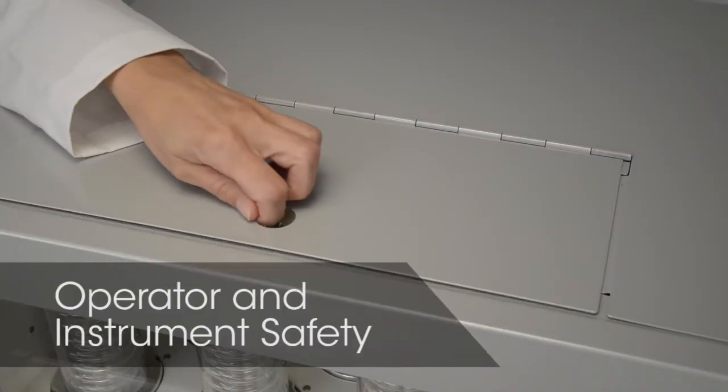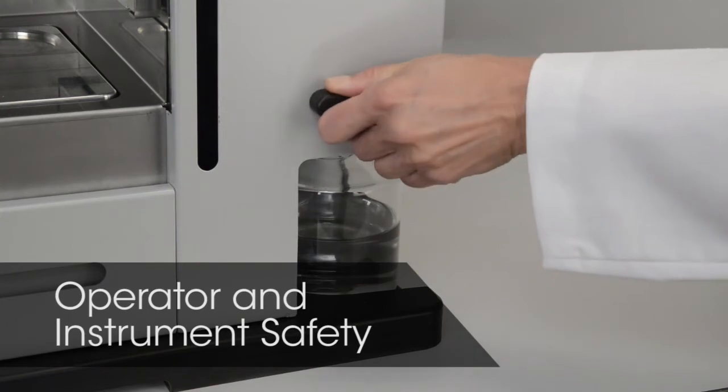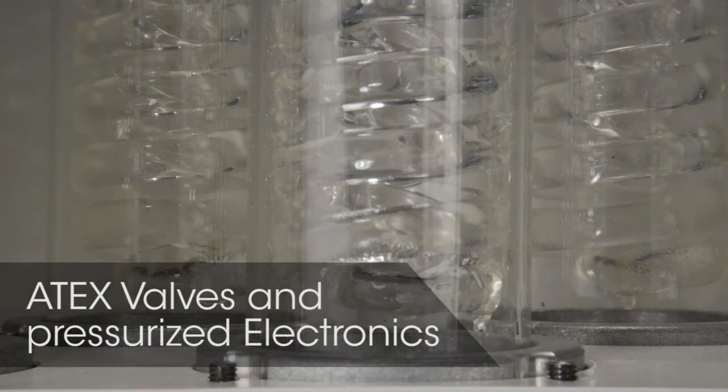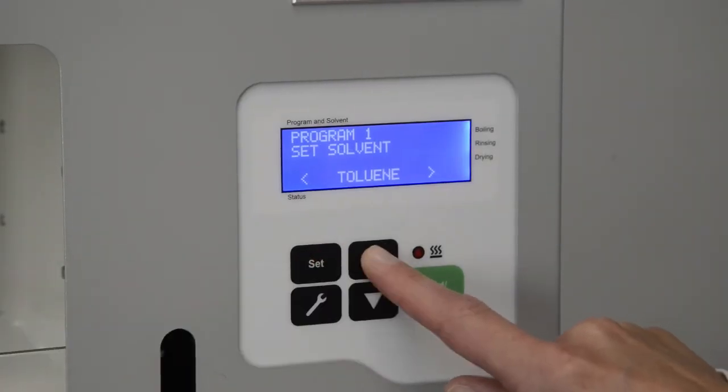Contact with chemicals is minimized, with easy addition of solvents and an easy-to-remove solvent recovery tank, maintaining high safety standards. Pressurized electronics and ATEX-classified valves ensure safe operation.